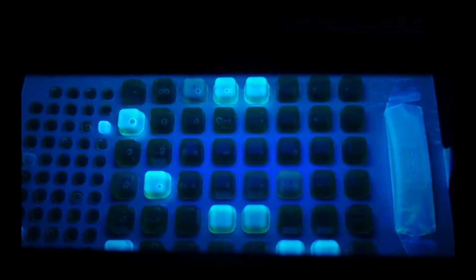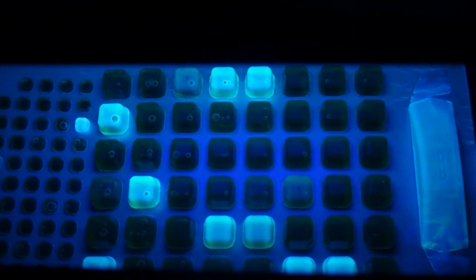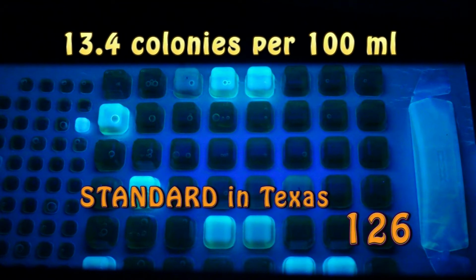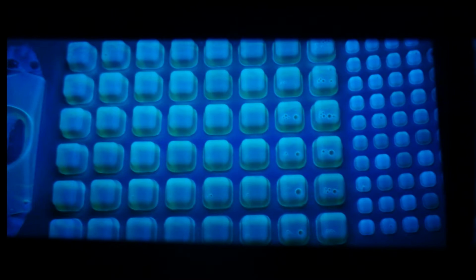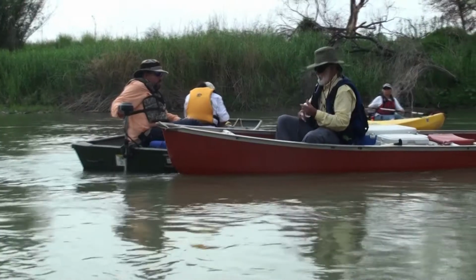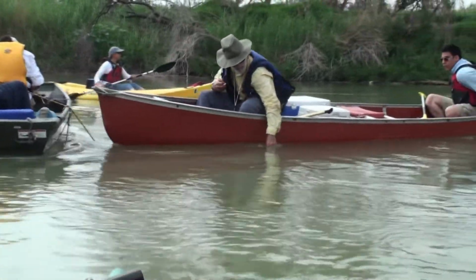This sample has 1 small well and 11 large wells, which translates to a value of 13.4. The standard for E. coli in Texas is 126, so this sample is meeting the standard. This sample, however, has all wells illuminated and has a bacteria value of greater than 2,419, which is well above the standard. Both of these samples were collected in the Rio Grande in the Laredo area.